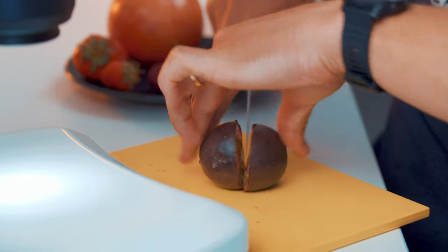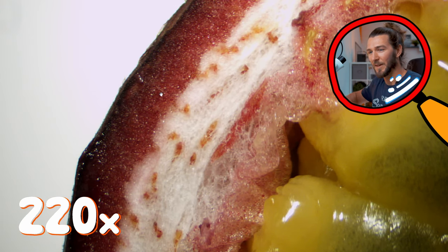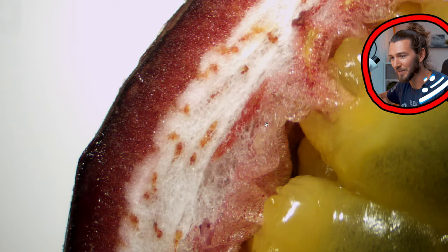On to my favorite — passion fruit! This one has a hard, tough skin. I love the smell, it's super tropical. What we got here is a skin layer on the outside that protects the whole fruit, then we got the white layer which has speckles in it — some red speckles. I'm not sure what this is.